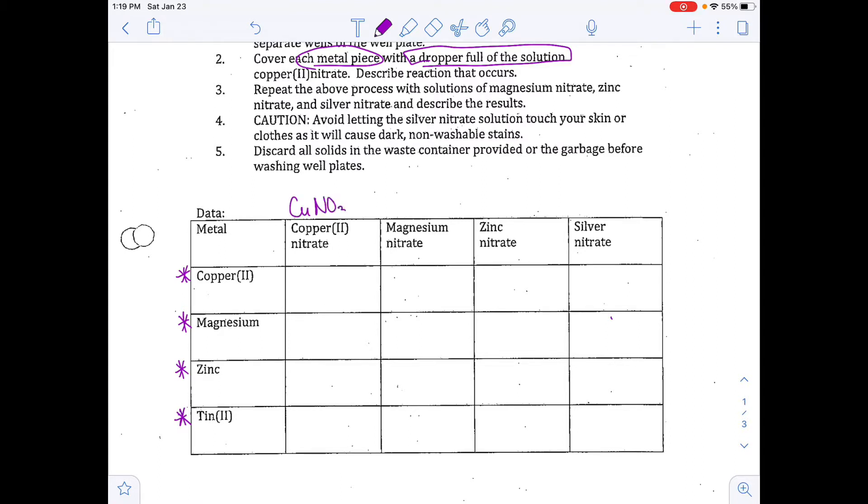We'll be using copper nitrate today — the formula is Cu(NO₃)₂ — magnesium nitrate Mg(NO₃)₂, zinc nitrate Zn(NO₃)₂, and silver nitrate AgNO₃.